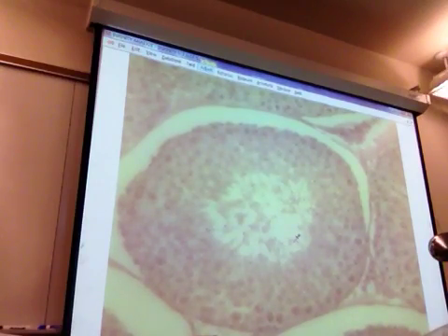Let's see real quick here. I just wrote down, she said between spermatogonium and spermatocytes. So how would you differentiate between a spermatogonium and a nurse cell again?